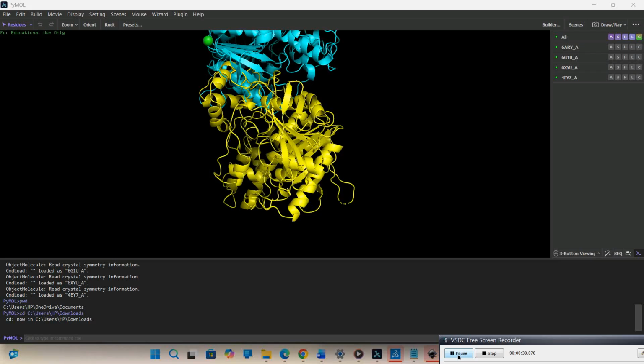Today we continue in our tutorial series, and I'll show you another important feature in PyMOL. Specifically, this is important if you have a comparative analysis of several orthologs of a particular enzyme. The one common challenge you will face is that the residue numbering in these orthologs, even if they are the same enzyme but from different species, may not be the same, especially when the crystallization is done by different laboratories.